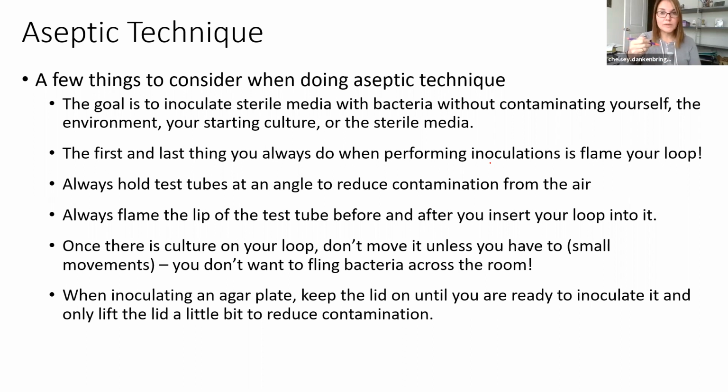The first thing you always do is you sterilize your loop, okay? I say that you flame your loop. You put it inside the flame. The wire loop will glow, okay? It heats up real fast and it turns bright red. And that's how you know it's sterilized the environment. And then you remove your loop from the flame because we need to let it cool.